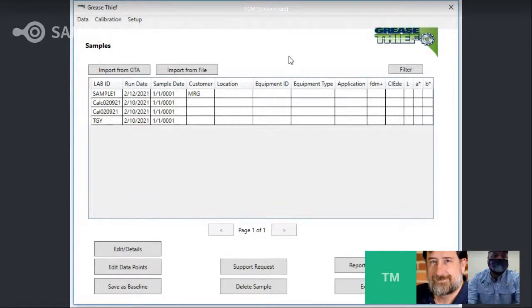There are some applications that we have found, depending on the grease type, machine working, or kind of load, for example, that might have a different set of criteria, where it might be plus 20, minus 40 for a wind turbine. The main bearing on a wind turbine, the grease, oftentimes the consistency will drop quicker right as it goes into service, but then we see it maintain that lower level once it's thinned out just a little bit.